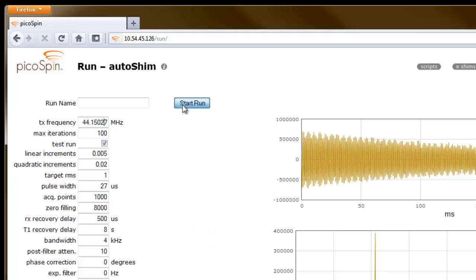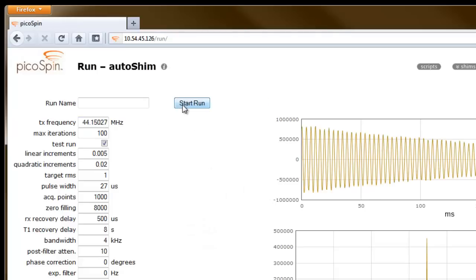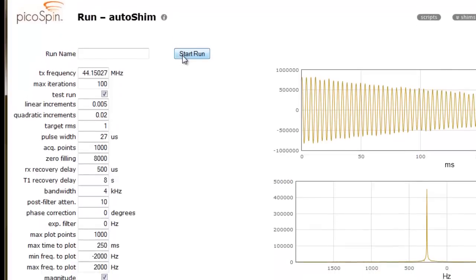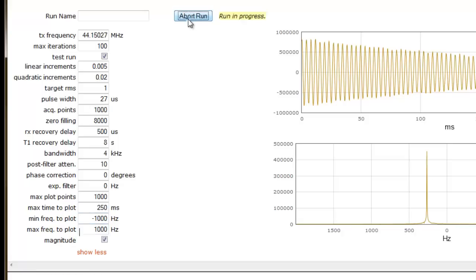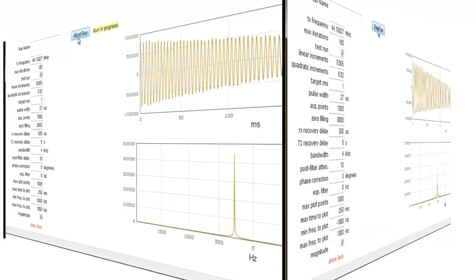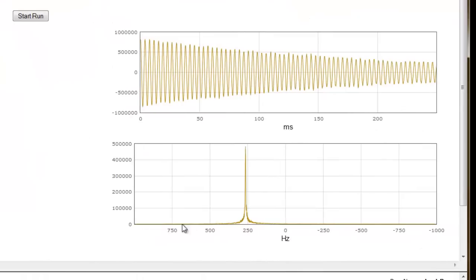Then I'll execute the AutoSIM script by clicking Start Run. Let's zoom into the signal by adjusting the min and max frequency to plot values from plus or minus 2000 Hz to plus or minus 1000 Hz. Let's execute the AutoSIM script once more. It looks like we've done a good job positioning our signal close to the target of 200 Hz.